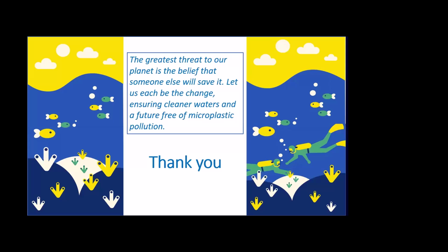And also when you have biochar, biochar also gives some particles to your solution. So you never know whether it is coming from biochar or from the microplastics itself. So it's not really good to use those kinds of methods as standard methods. You will have a lot of questions from reviewers if you submit those kinds of manuscripts to papers.